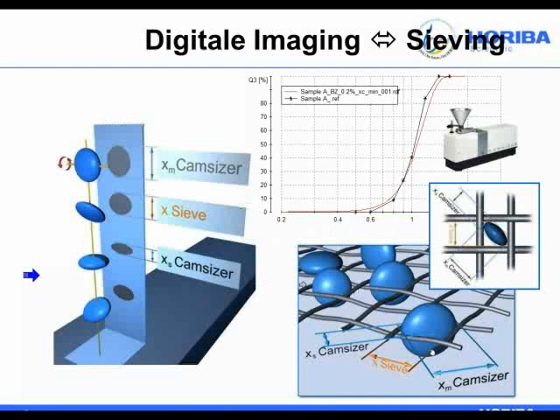So here the point about sieving is, again, that the second smallest dimension is what you're measuring with the sieve. If you have an M&M shaped particle, it's not measuring the circular projection. It's not measuring the end-on projection. What it's actually measuring is how this particle will fit through diagonally. That's the second smallest dimension.